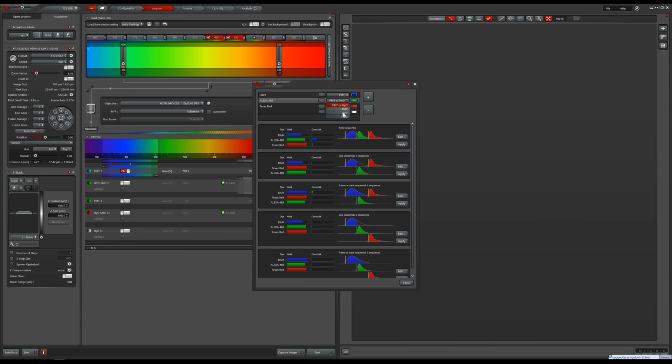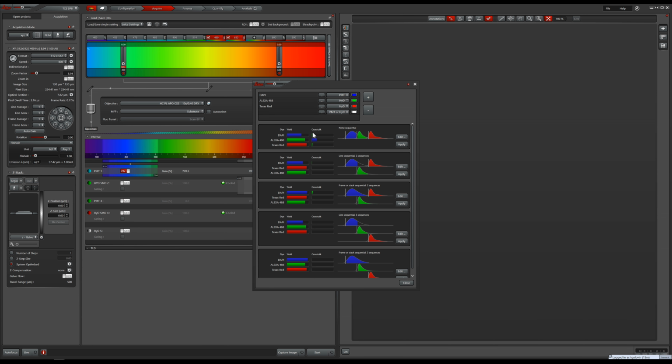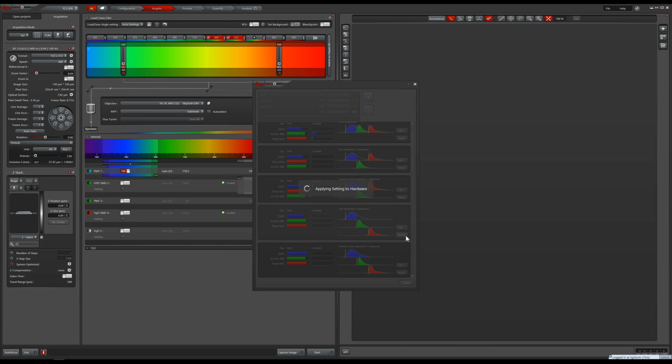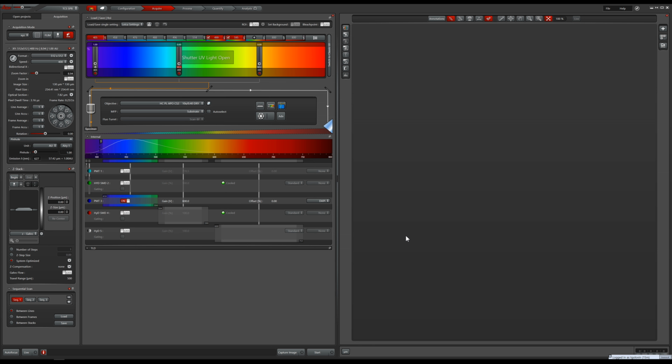Next, typically use a PMT for DAPI or other short wavelength dyes, as those are often very bright and do not require the higher sensitivity of a HYD detector. For the other fluorophores, simply use the HYD detector. Then, select the scanning mode that will cause the least crosstalk between your channels. The line sequential has the benefit of allowing you to see all channels simultaneously during scanning. Loading these settings will add a sequential scan subtab on the left side. Start the live mode.